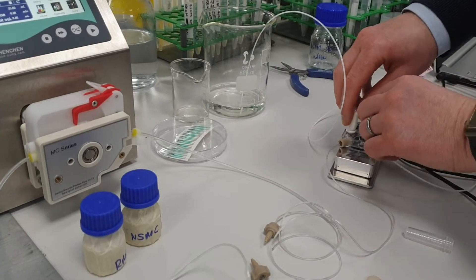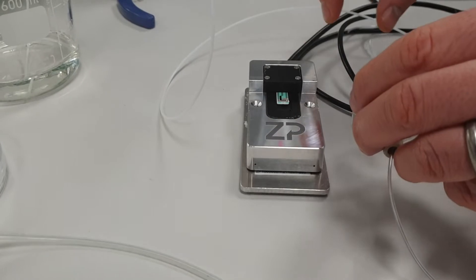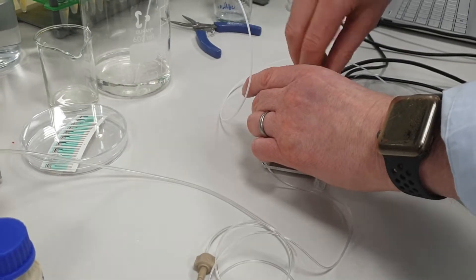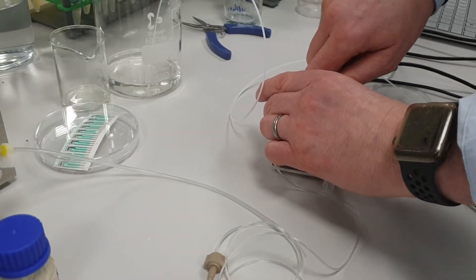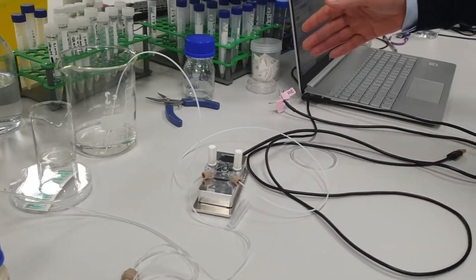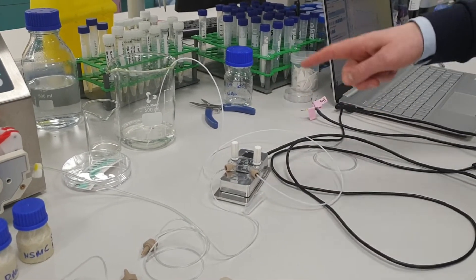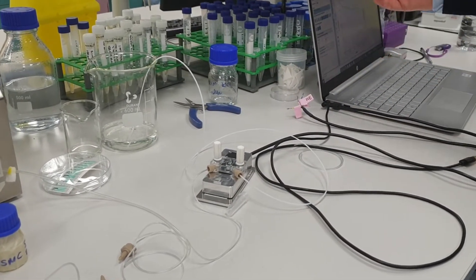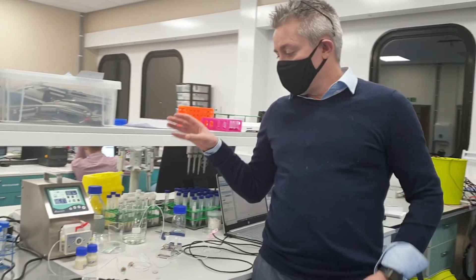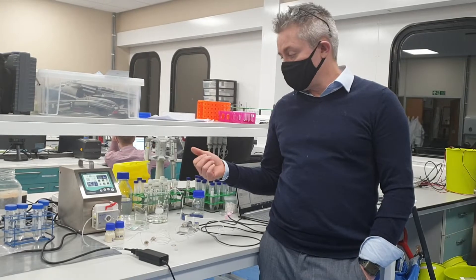If I just loosen this off, you'll see that we have a ZP hypervalued carbon electrode in there, and this essentially brings fluid onto the face of the electrode and sends the fluids to waste. The sensor, or the screen-printed electrode, is connected to the computer by a USB cable and we're recording electrochemical data on the computer. So this is a flow system designed for testing biosensors and screen printed electrodes.